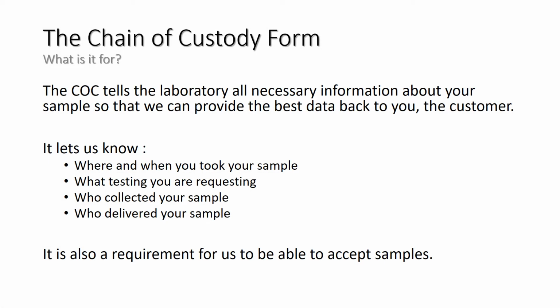The chain of custody is a required form for all samples submitted to the laboratory. It tells us necessary information about your sample so that we can process and analyze it properly. In order to accept your samples, we need the information on the form.